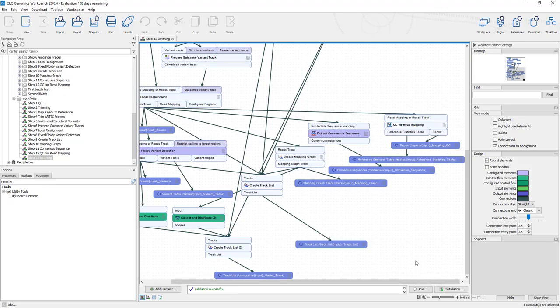And in particular, it's nice to do that for some of the mapping QC results and not only batch that report and combine that report across multiple samples, but also export that as, say, an Excel file where you can manually look at that, add other metadata, maybe do some filtering or some other changes. So we're going to demonstrate that today.